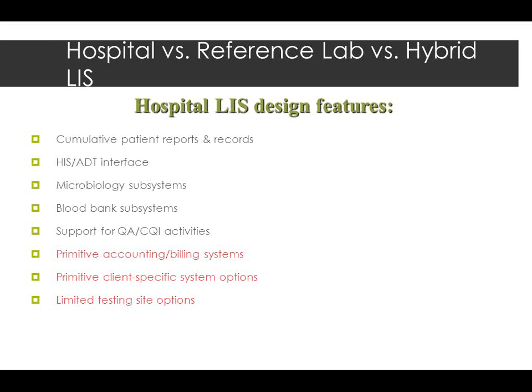So LISs grew out of two different worlds, hospitals and reference labs. Okay, and now we're moving towards hybrids, and most systems are now hybrid, and I'll show you what that means. So hospital LIS design features, things that hospitals need is we need a cumulative patient reporting.